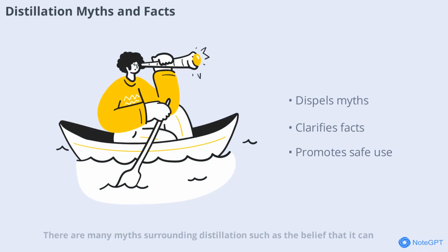There are many myths surrounding distillation, such as the belief that it can remove all impurities or create dangerous substances. In reality, distillation is a controlled and precise process, but it does have limitations. Understanding the facts helps dispel misconceptions and promotes safe, effective use.